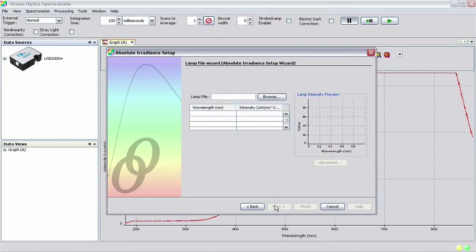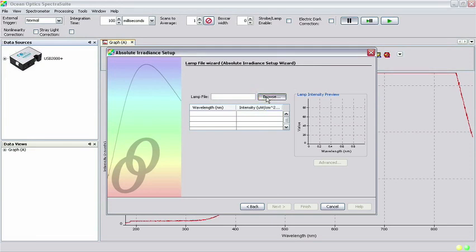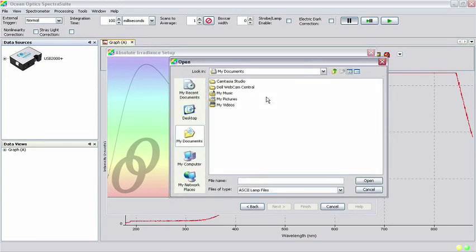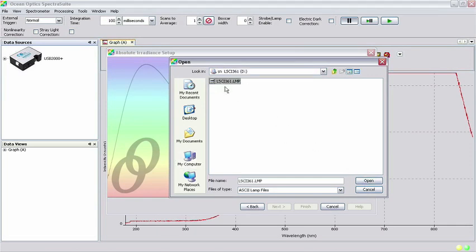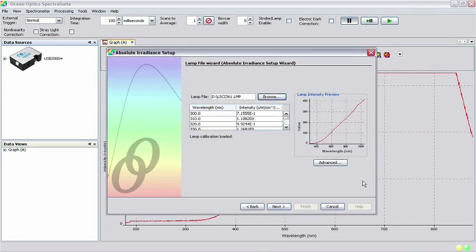In the next screen, you will be asked to load the lamp file from the CD included with your light source. Insert the CD and click the Browse button. Navigate to the location of the CD and select the file that begins with the name LSCI and has a .LMP extension and click Open. Then click Next.